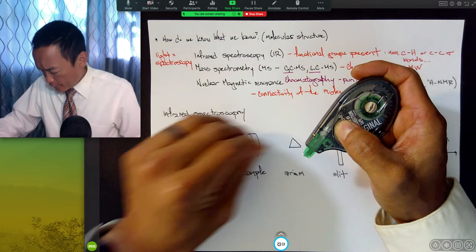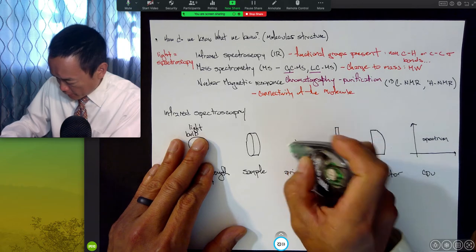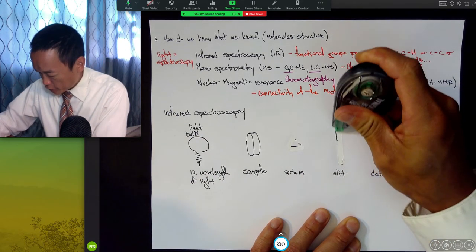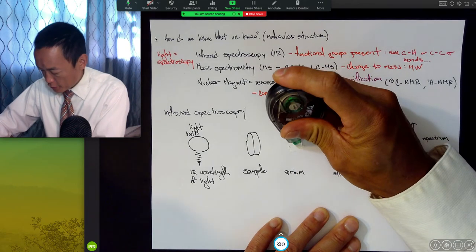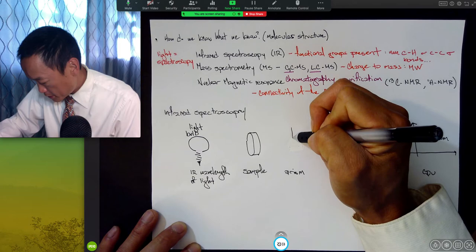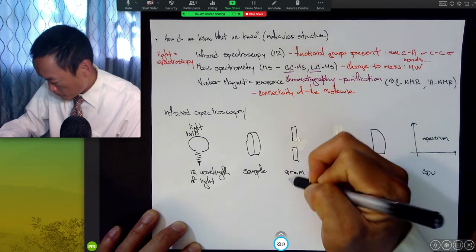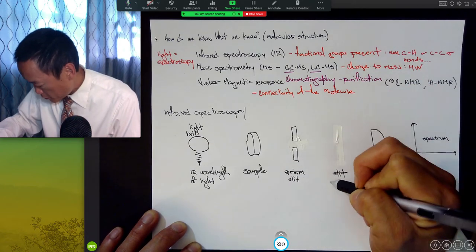I am going to redraw this because I believe I have it backwards. The slit should appear before the prism, because that would make a lot more sense moving forward. So we'll just swap those two things, because you will see why in just a second. We'll put this slit right here, which makes a little more sense, and then we'll put this prism here.